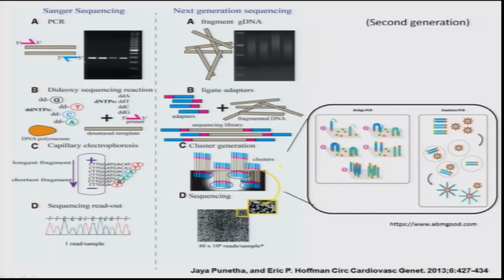Basically you have some solid devices in which you have sequences that are complementary to the fragments having these adapters. So the sequences are complementary to the adapters.